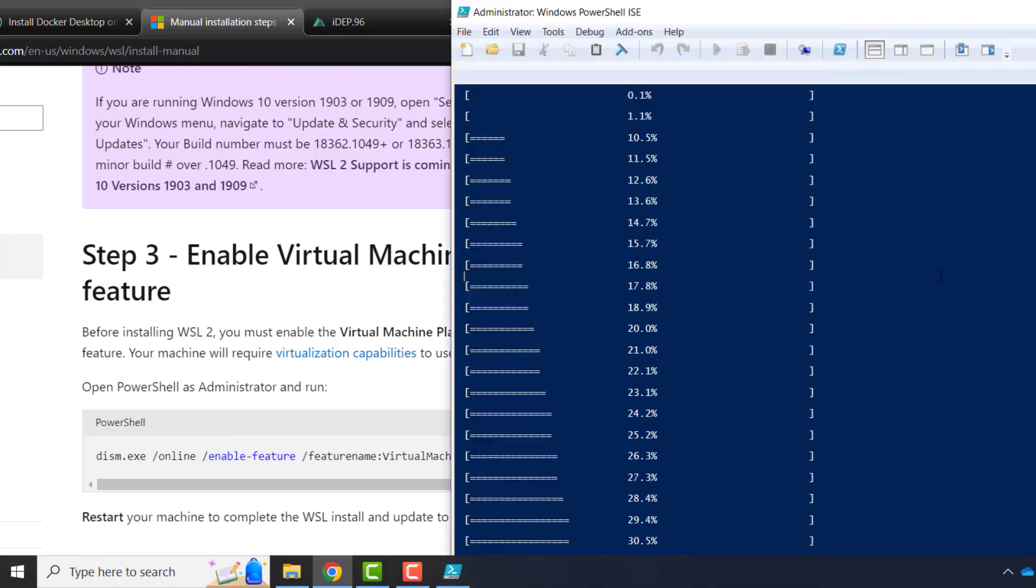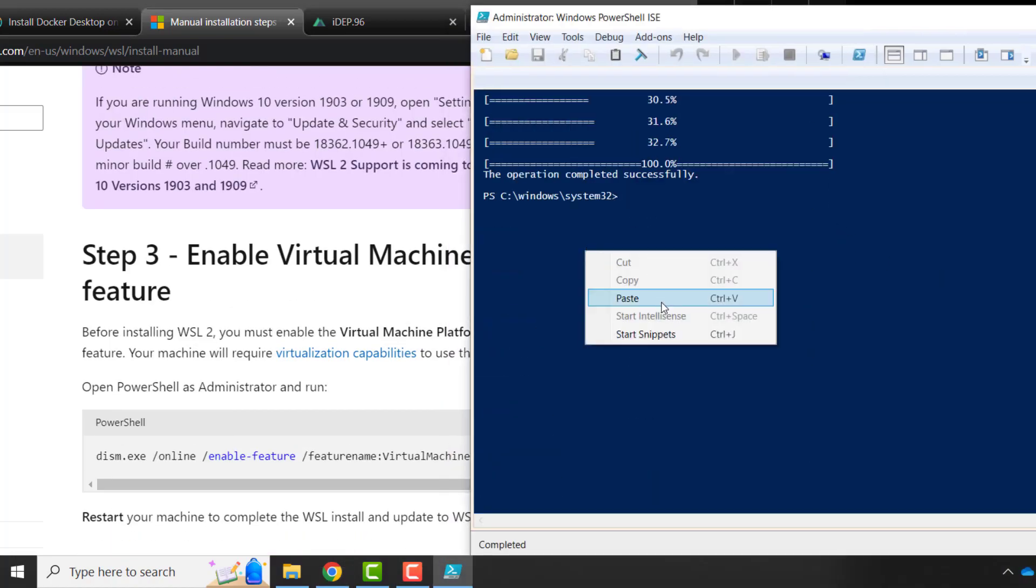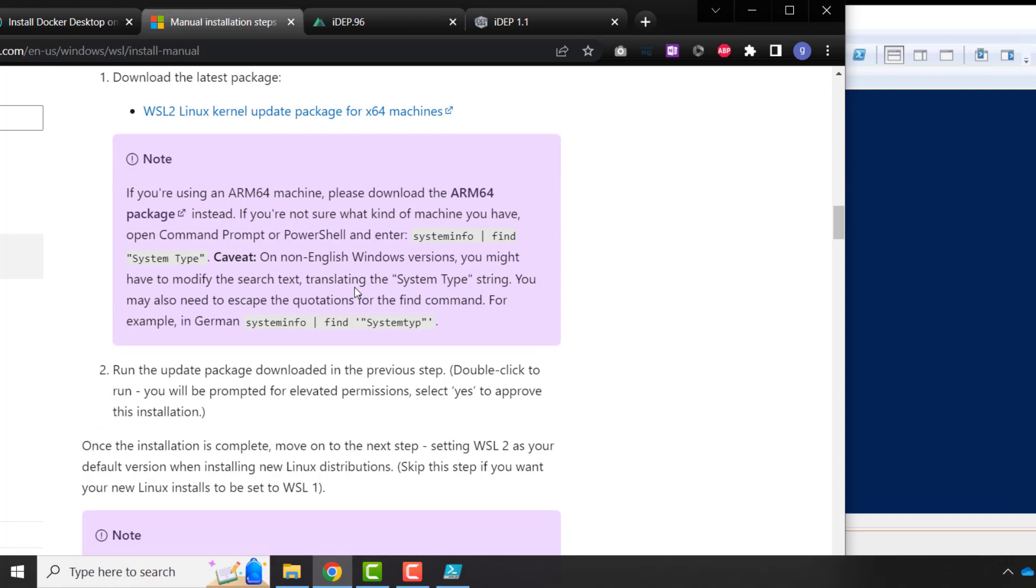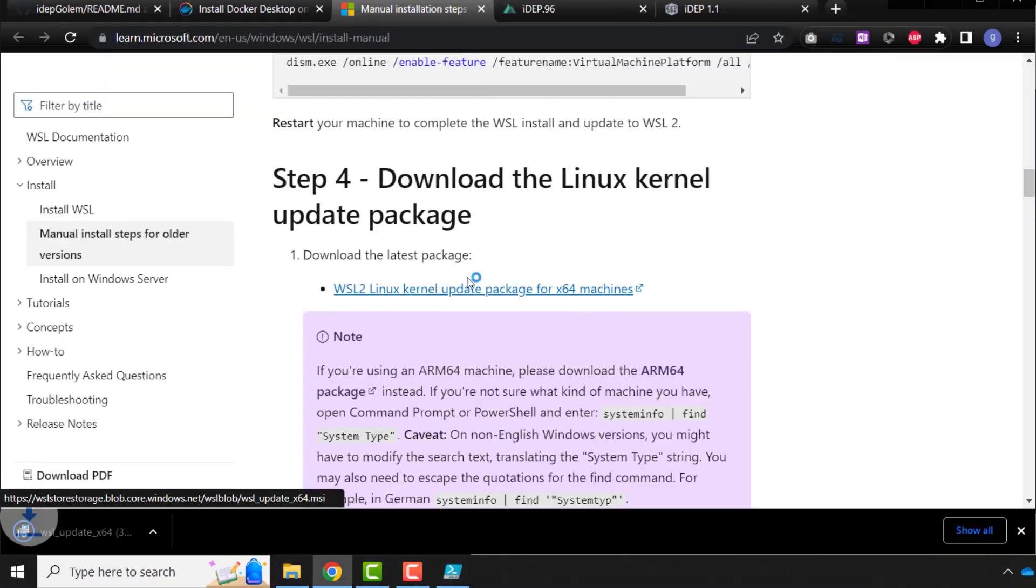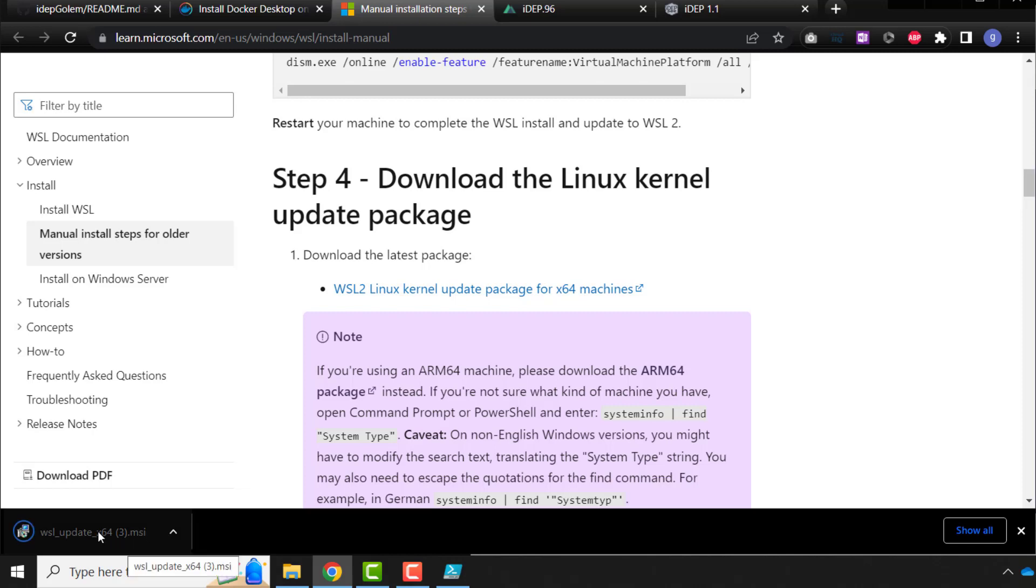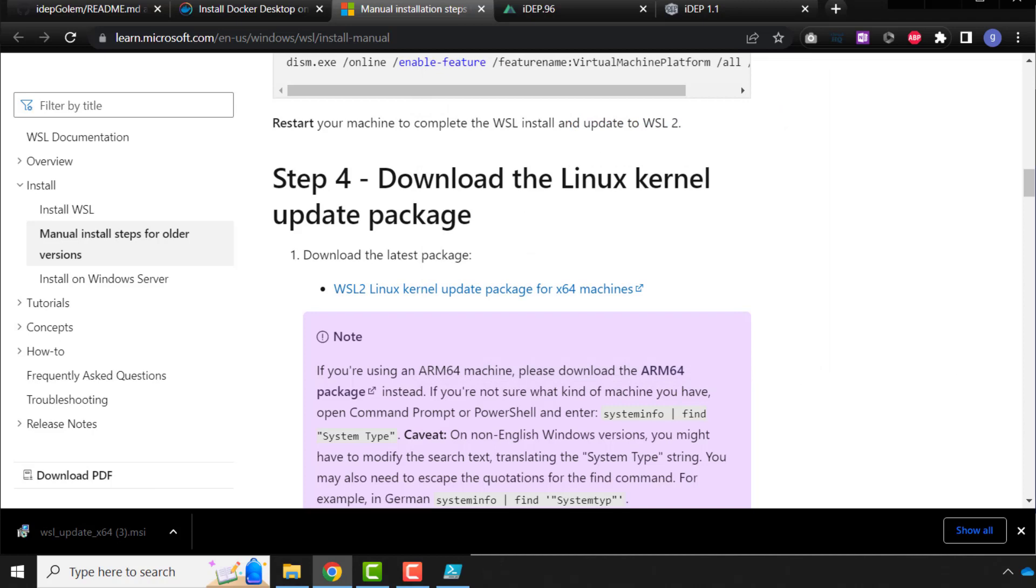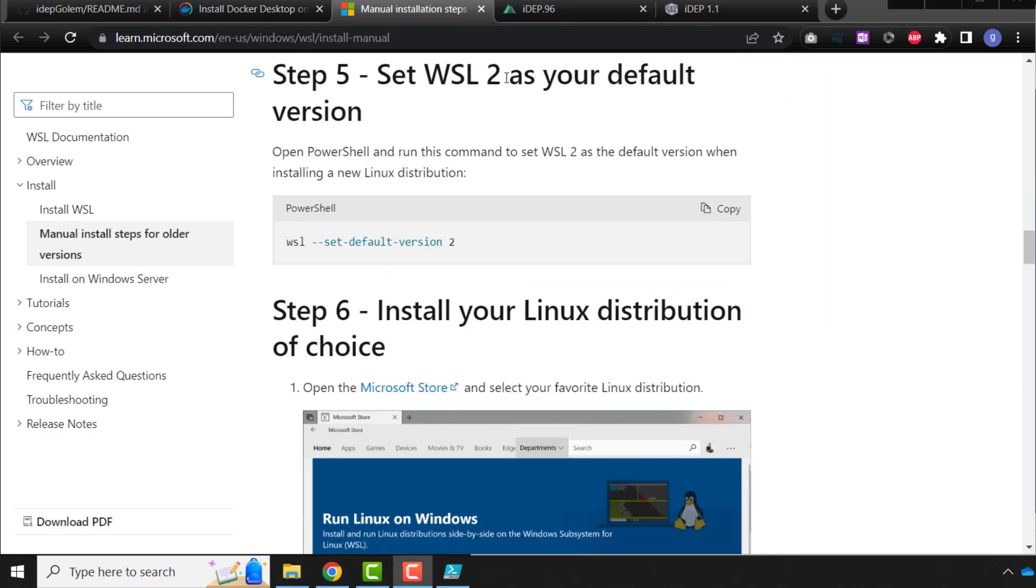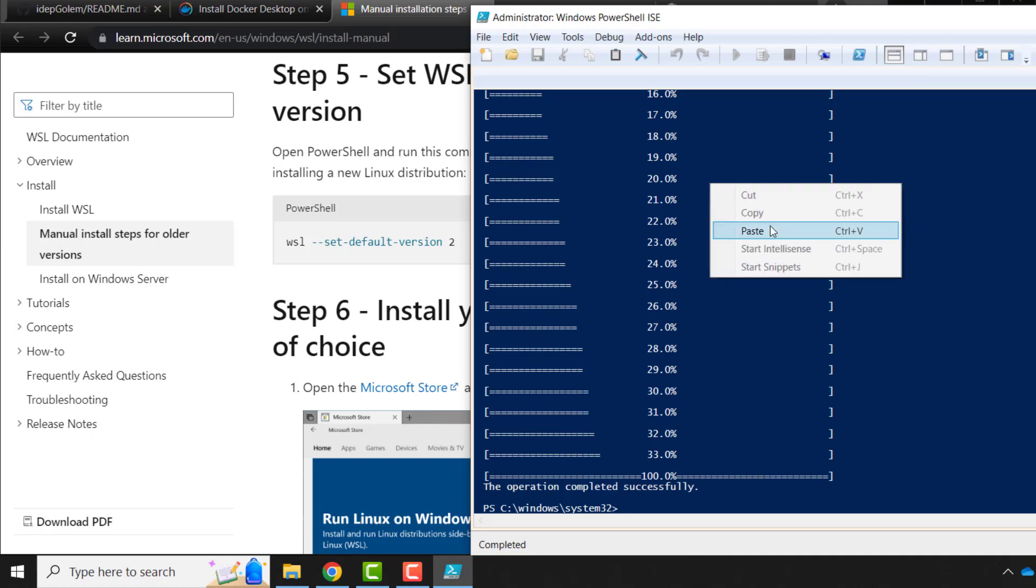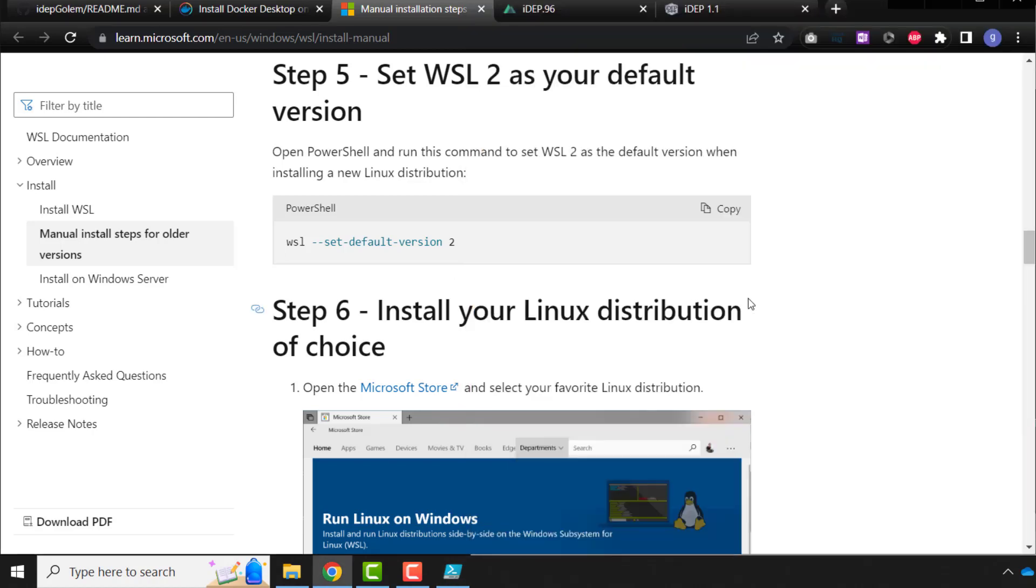Enable virtual machine features. So paste, completed. So we download the Linux kernel, and install the MSI file. So double-click this, install, finished. And the next step, WSL2 as default, so copy this, come to here, and paste, finished.